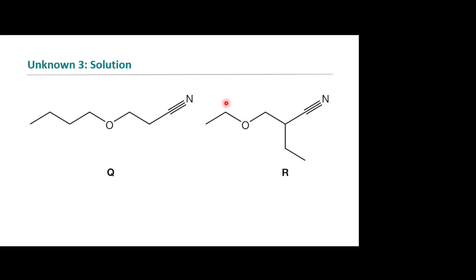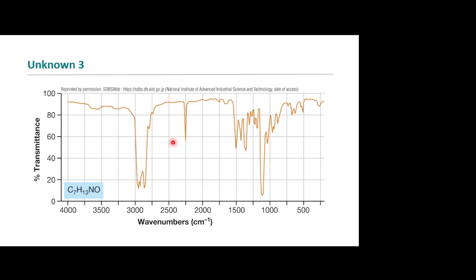Never mind. I think I was looking at the wrong thing. Yeah. So there's not a carbon oxygen band that shows up, because the one on the chart is alcohol, ester, ether, carbon single bond to an oxygen at 1,050 and 1,150. So that would be way down here. So this is probably the carbon oxygen ether stretch.